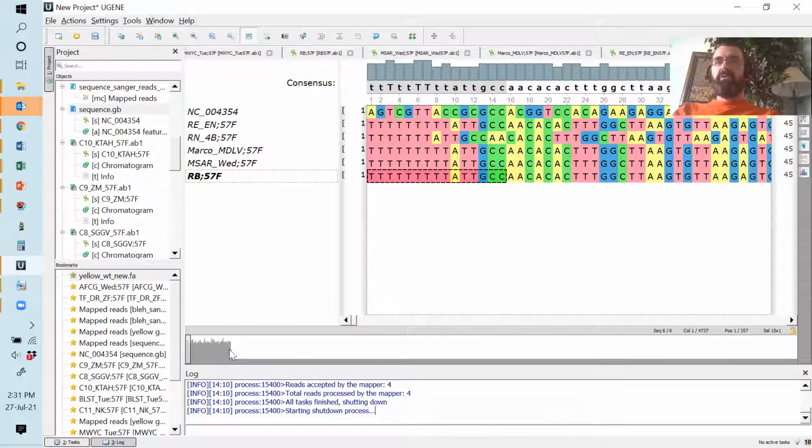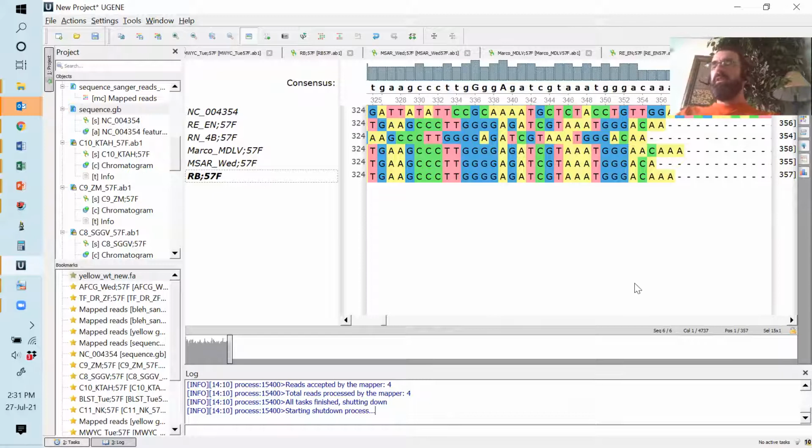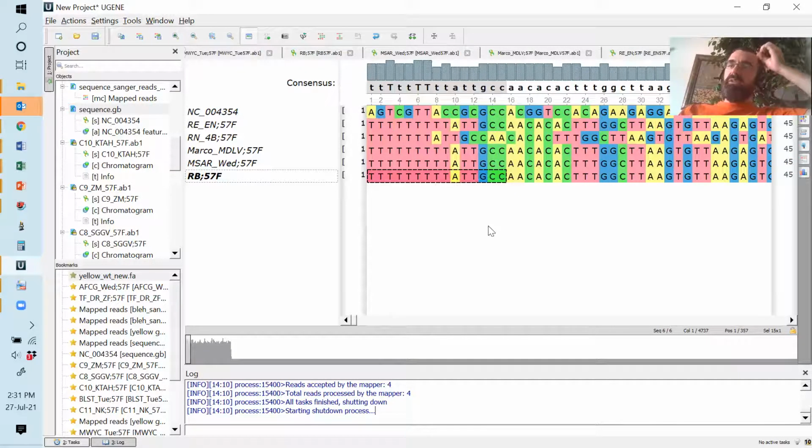Now, it's not going to hurt to have a look over the other end of the sequence, but that all looks pretty fine to me. Typically, you don't tend to get into issues with sequence reads at the 3' end until you've gone 600 to 800 base pairs. And ours is only 400, so that's pretty straightforward. Most of the issues tend to be at the 5' end at the beginning of the sequence read. Everybody with me so far? Give you time to catch up.